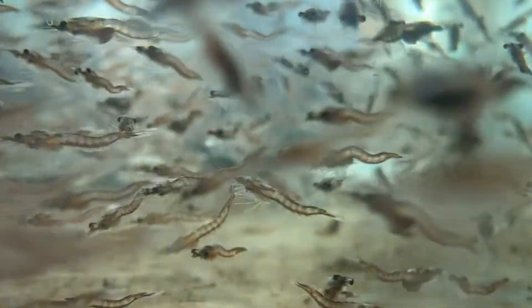You can see them swimming about. And then when they grow up to adults, approximately one centimeter in size. There are differences between the male and female adults, which then breed. And in good conditions, they'll breed and produce little small nauplii straight from the parents.